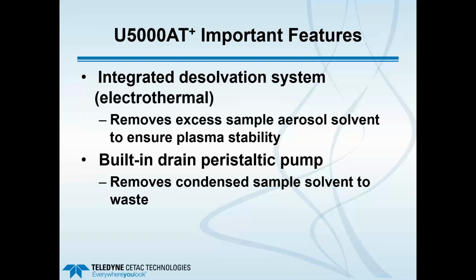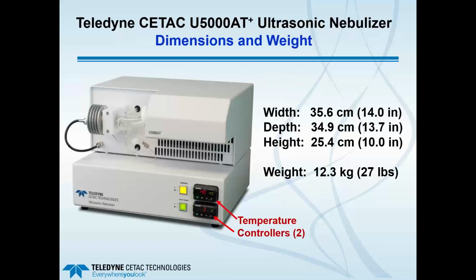You would typically use the host peristaltic pump that is from the ICP, which is normally under computer control of the ICP software. And you would use that pump, like with the standard nebulizer, to move sample liquid to the ultrasonic. Again, this drain pump is simply there to remove excess condensate. I will move back one slide.